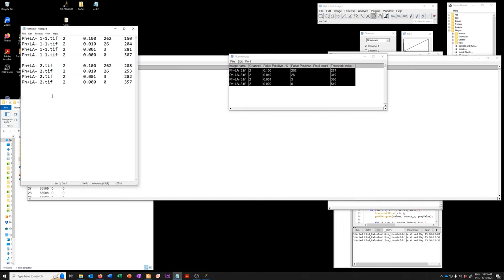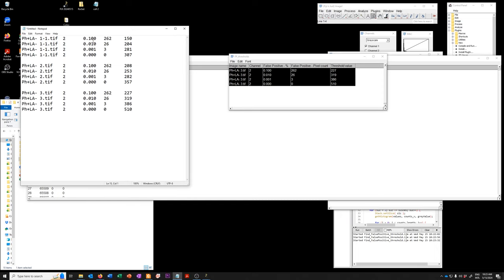So you can see that if I take, for example, a 0.1% tolerance, the thresholds across the different images are 150, 208, and 227.